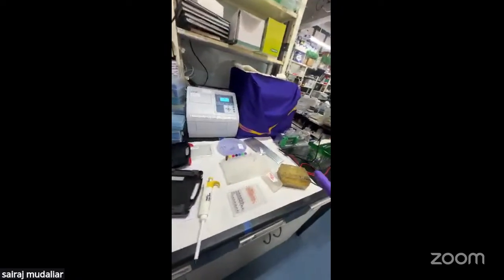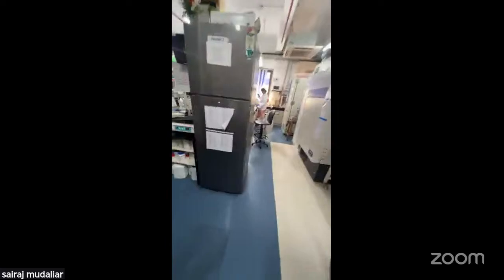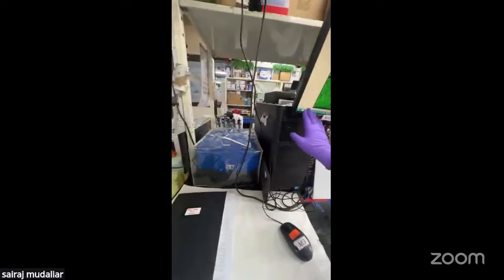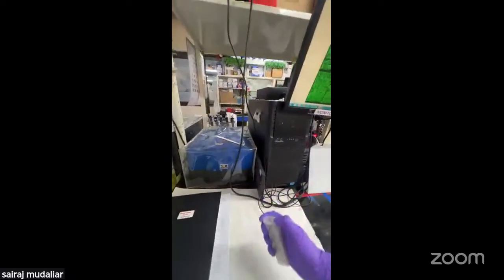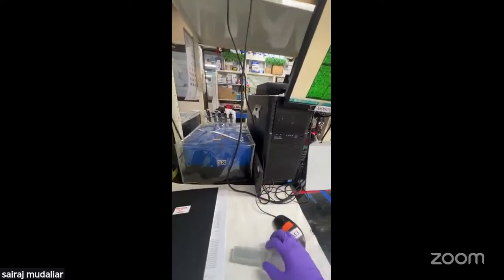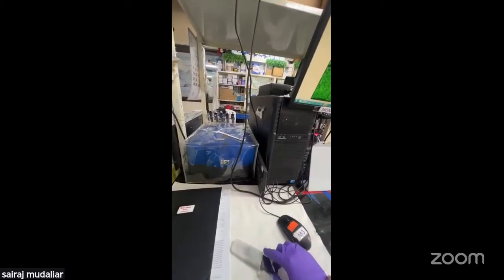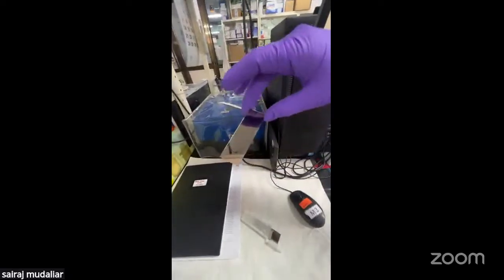Another method which can be used for this kind of quantification is, I will just show it, the protein microarray. What you can find, like this is a plate reader. This is a protein microarray. You can load your samples or the tissue lysates into these protein microarray chips, which consist of around 20 to 30,000 proteins, which are spotted in duplicates. This is how a chip looks.